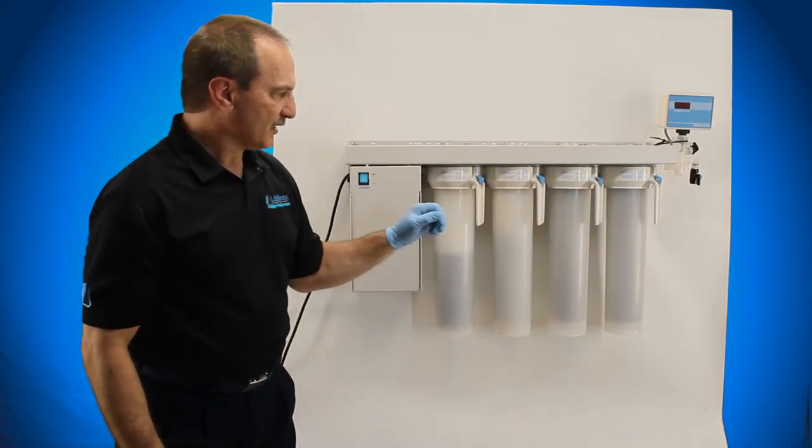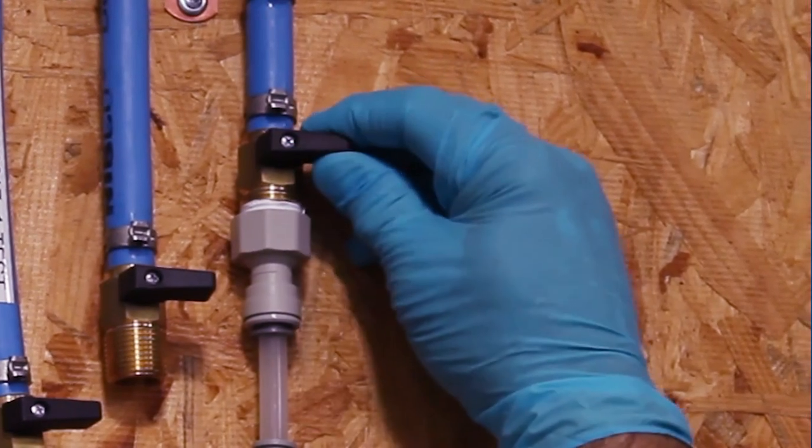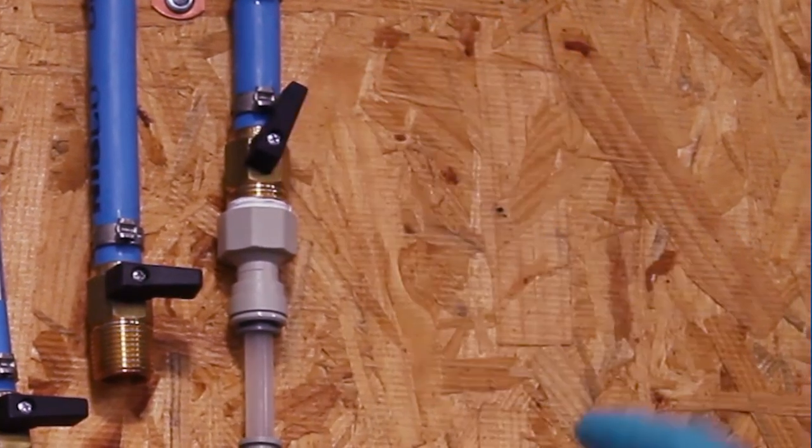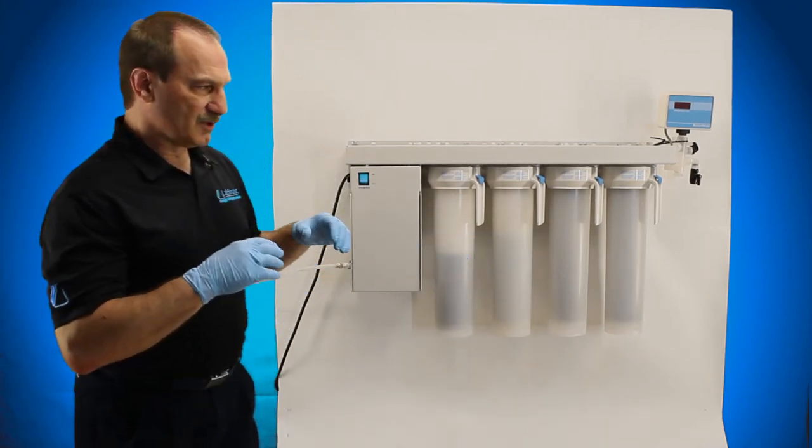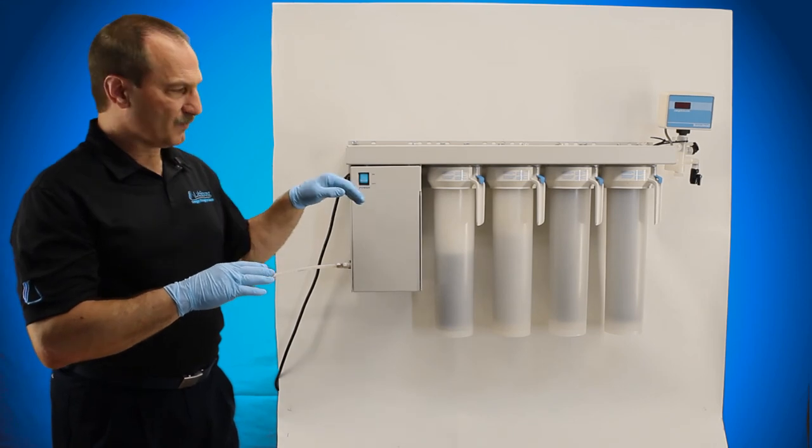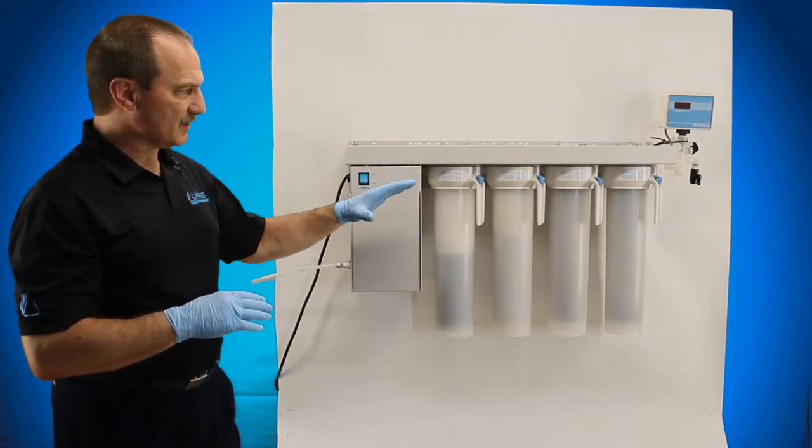I usually suggest the incoming valve opening it up about half way, because you don't want a lot of pressure pushing it through to get that air out. Sometimes you get air trapped in some of the cartridges, and just a slow flow of water through will help get that air out and not damage anything.